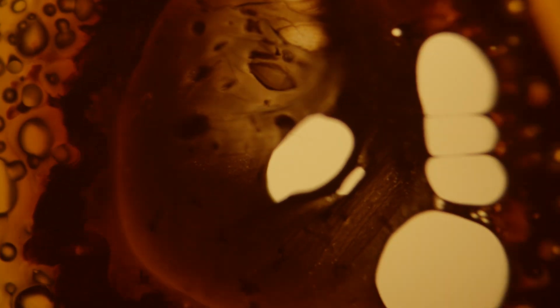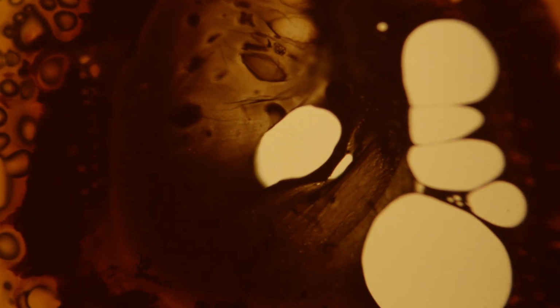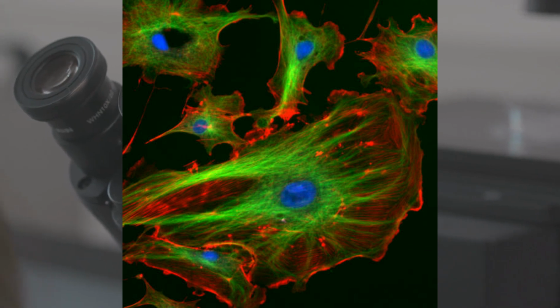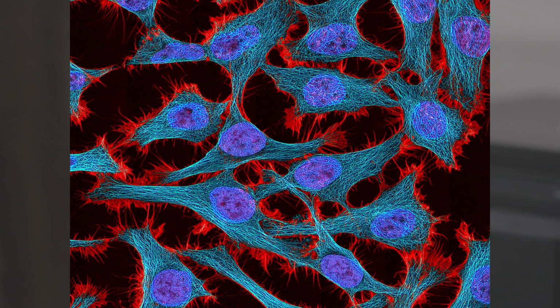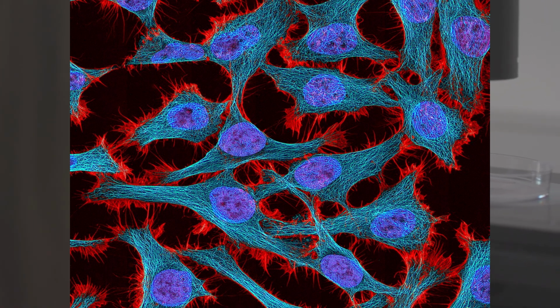And certainly with less innate or intrinsic methods, for example with stains and immunofluorescence, you really can't look at a lot of different things at the same time. This means that you're really limited in how much you can examine, and typically speaking, it only tells you as much as what you're looking at, because the way the microscopes are designed for this, they really only let you visualize what you're looking at and looking for in terms of the fluorescence, and not necessarily anything else.